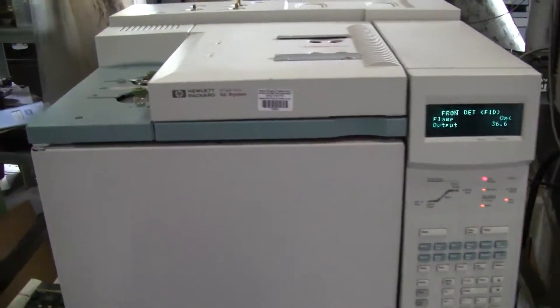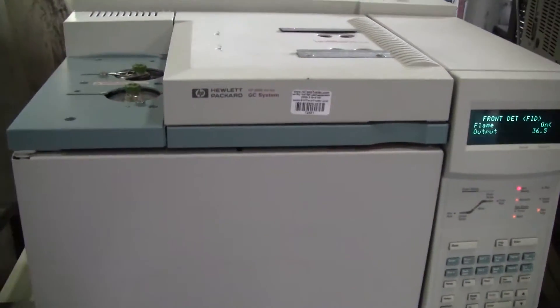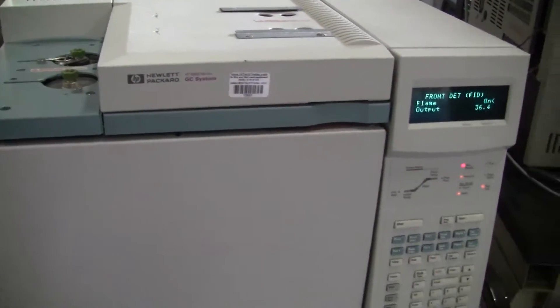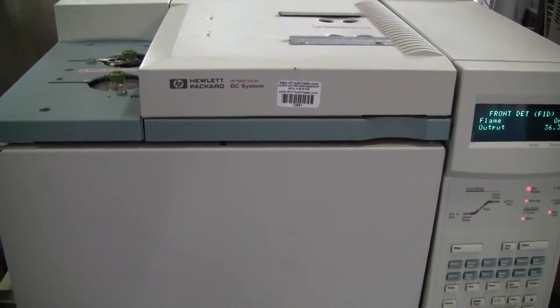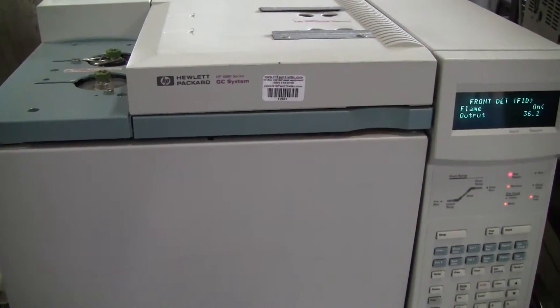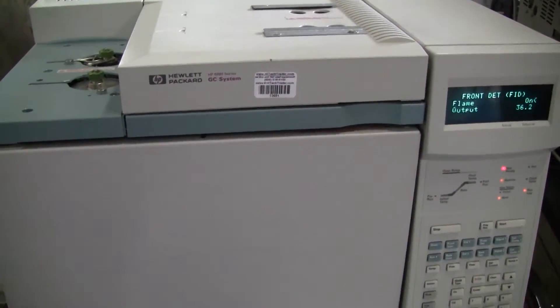Hi, this is Michael from Hi-Tech Trader. Today we're looking at a 6890 Agilent HPGC system.